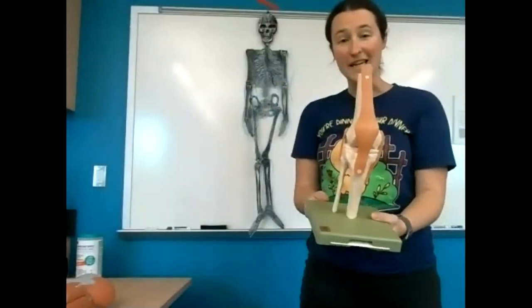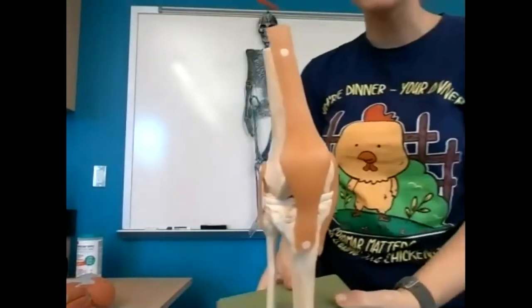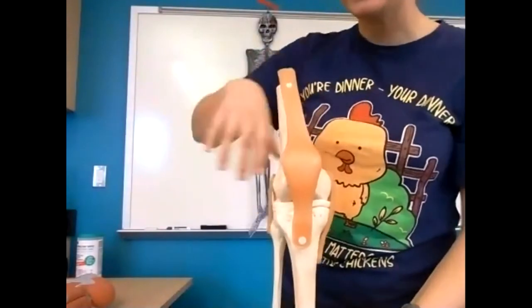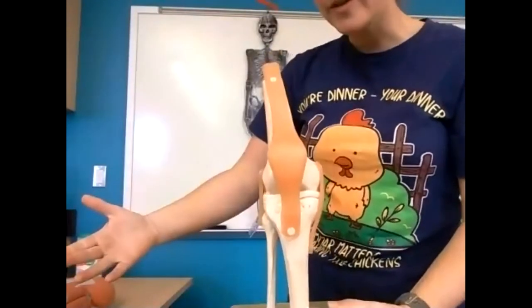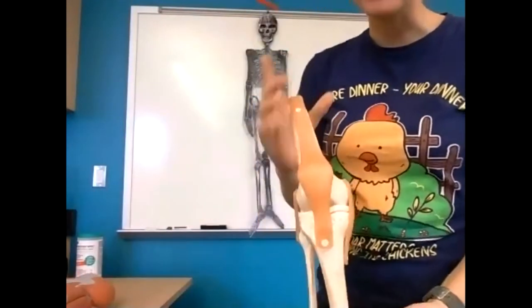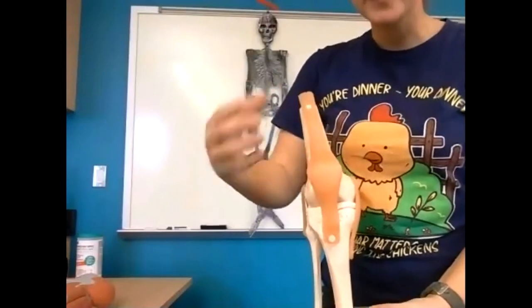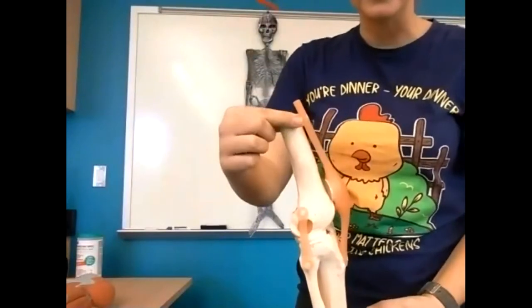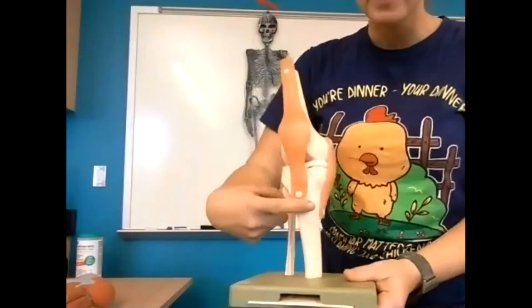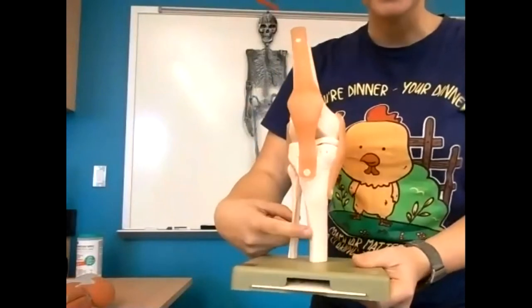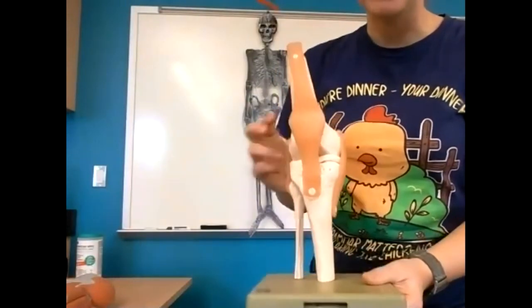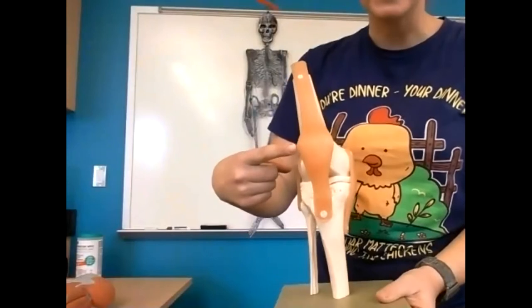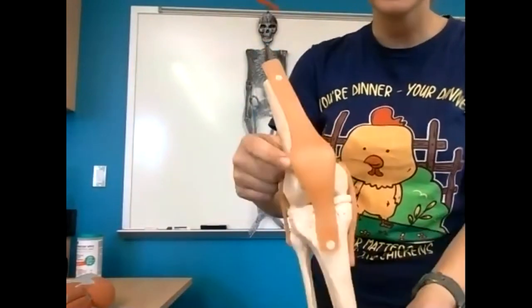This is the knee — something you'll study in detail starting with exam three material. For now, just for a little orientation: this bone up here is the femur, the thigh bone. This is the shin — the tibia — and the skinnier one is the fibula. This is the patella, or the kneecap.